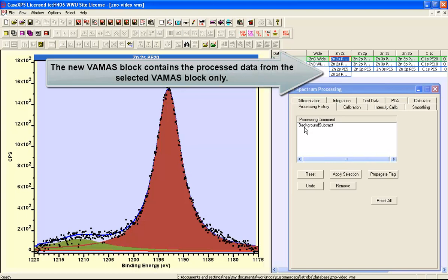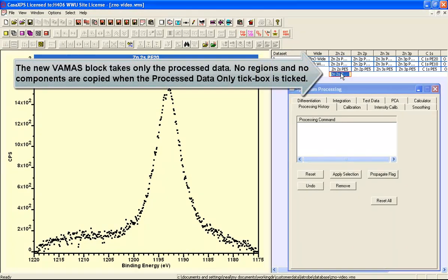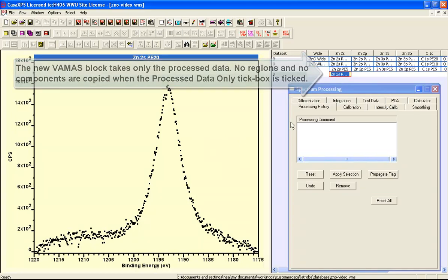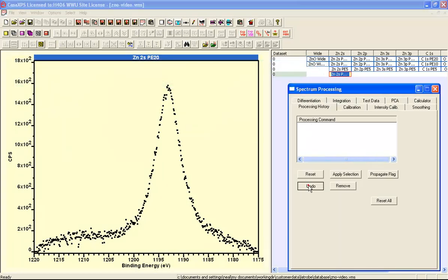The original VAMAS block allows the undo option to return these data to the original state, whereas the copied version now only has process data as the raw data within the VAMAS block — no instructions and no undo operation can be performed on the copied data.